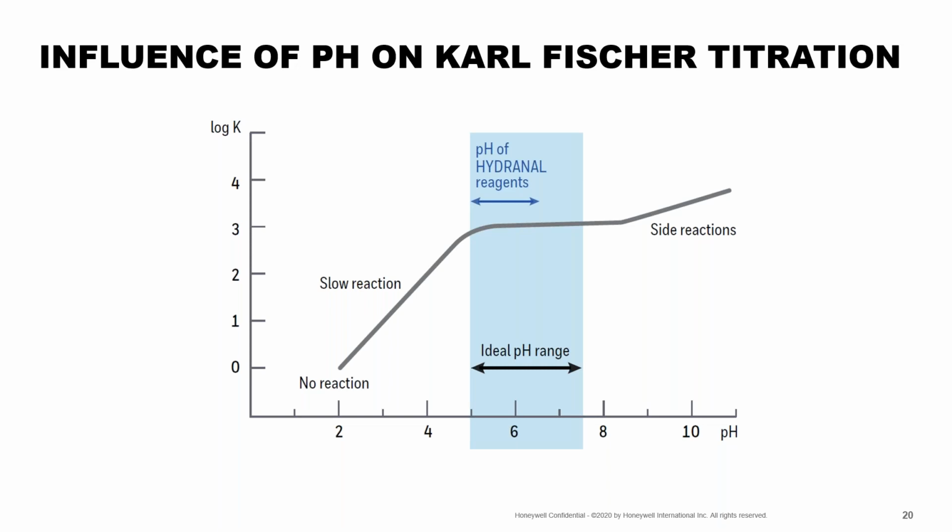And you can see from 5 to about 7.5, we have a nice flat, consistent reaction rate that's quick, not going off at an extreme angle. This is really our ideal pH range that we want to always keep our working media in.